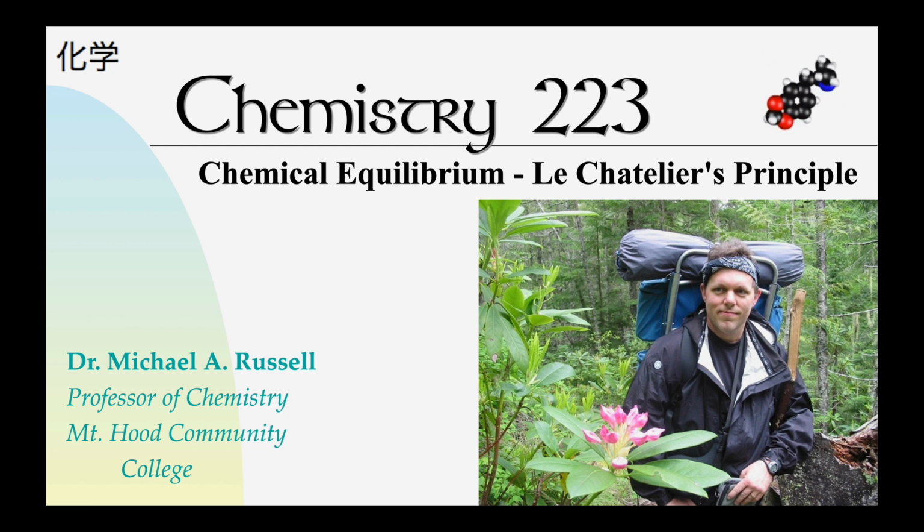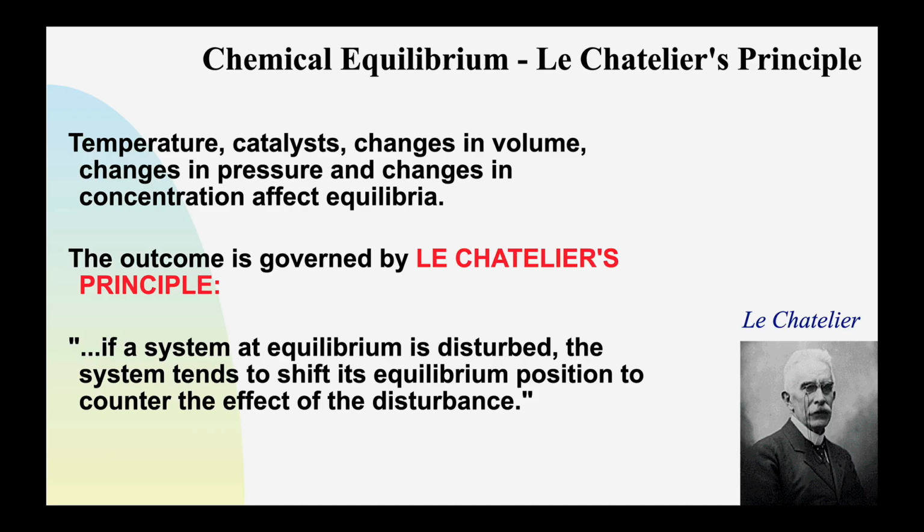This is also known as Le Chatelier's Principle Lab, and as you'll see, this is a big part of what we're going to be learning about today. Le Chatelier's Principle is an important part of chemistry, and basically it helps scientists to understand how a reaction reacts to stress. And by stress, I don't mean, oh my gosh, coronavirus or something like that. What I mean by stress in this case is like if you add a reactant, that tends to disturb the equilibrium, or if you remove a product. And you can also extend it to things like changes to temperature and pressure even, which is pretty cool.